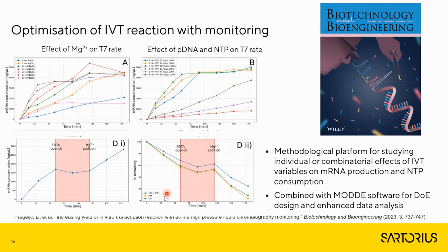We published this in the paper referenced below, and we were very proud also to get the front cover on Biotechnology and Bioengineering back in March this year, and I invite you to read this publication. Perhaps it gives some ideas about optimizing the reaction. But we don't claim that we have fully optimized the reaction. Rather, we would like to suggest there is high value in looking at the reaction in near real time by complementing mRNA concentration data with nucleotide consumption data, which gives a lot of insight, oftentimes over information that is not detected, not recorded, during the process of optimization.